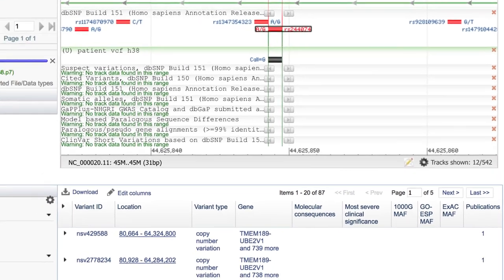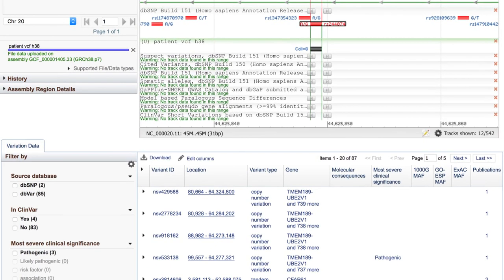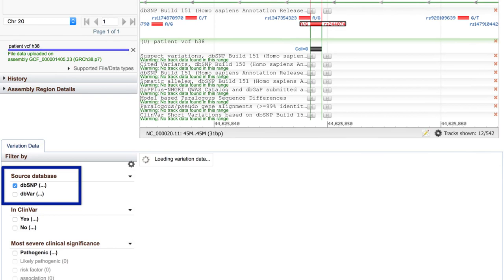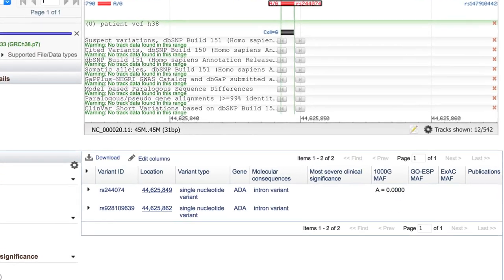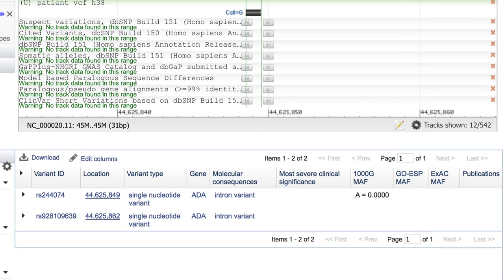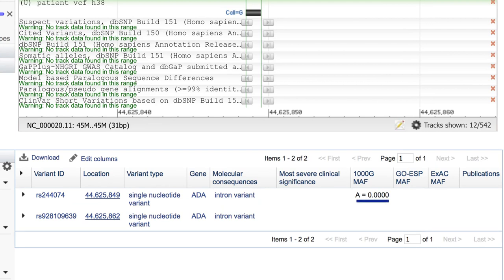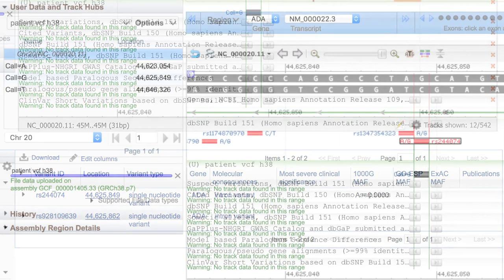Let's see what we can learn from the Variation Data table below the Sequence Viewer display. I'll filter by database, dbSNP, and we see our refSNP and that it is in an ADA intron. The only other information we see here is that the A allele was not seen in any thousand genomes population. Maybe this G is not a real variant after all, so let's put it aside and move on to the other two calls.